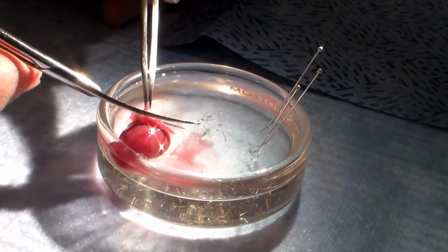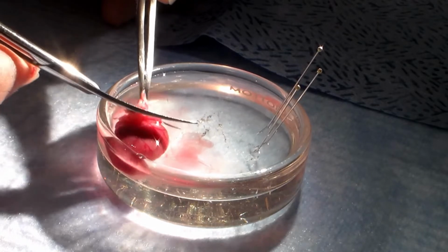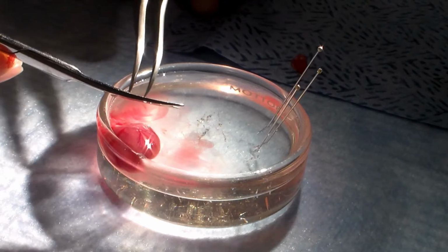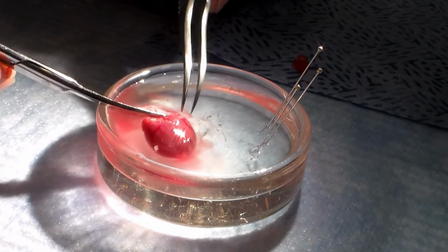What you see now is a rat heart. Using a pair of forceps and a pair of scissors, the technician first trims away the atria, valves, and blood vessels that lie above the ventricles.